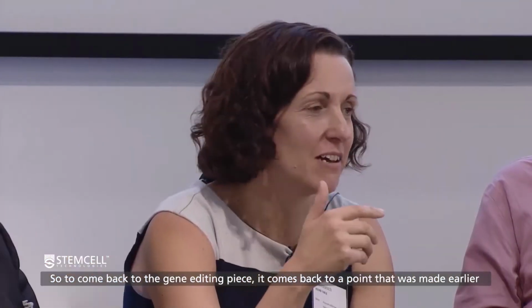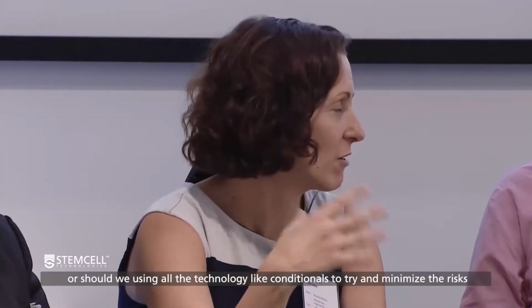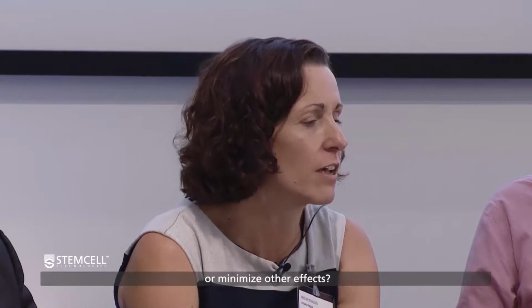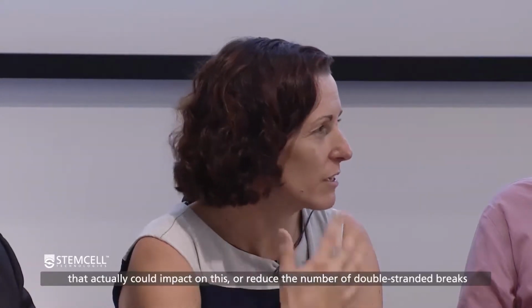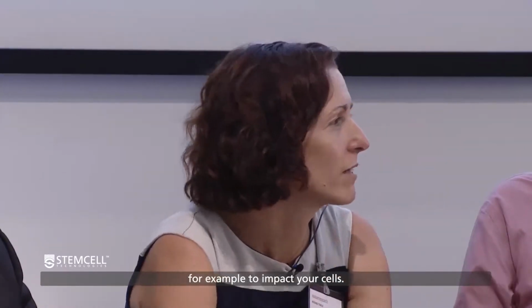To try and sort of finish up with the gene editing piece, I guess it comes back to a point that was made earlier about should we just be doing straight knockouts or straight edits, or should we be using other technology like conditionals to try and minimise the risks or minimise other effects? Is there technology out there that people are aware of coming through that actually could impact on this, or reduce the number of double-stranded breaks, for example, to impact on cells?